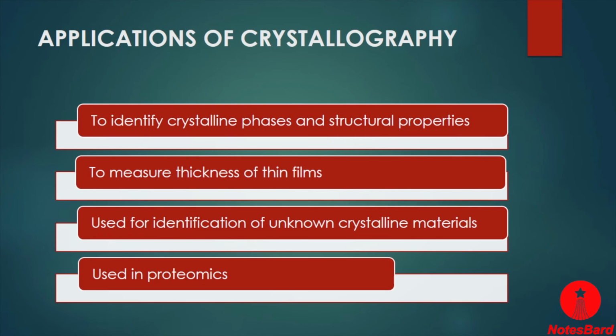Here the method of X-ray crystallography is used to study protein structure, interactions of proteins and several conformational changes in different structures like the primary, secondary and tertiary structure of proteins, and the different catalyzing methods adopted by different types of enzymes can be determined by X-ray crystallography. X-ray crystallography is also used to determine the structure of different proteins and enzymes, because we know that enzymes are also proteinous in nature.